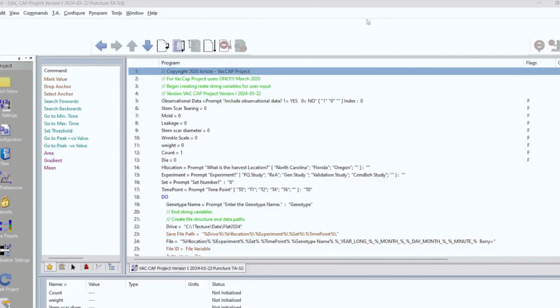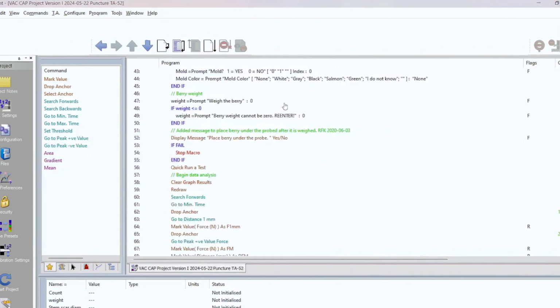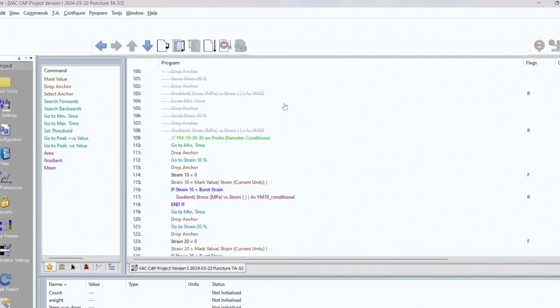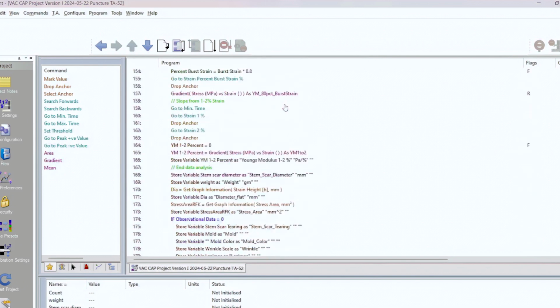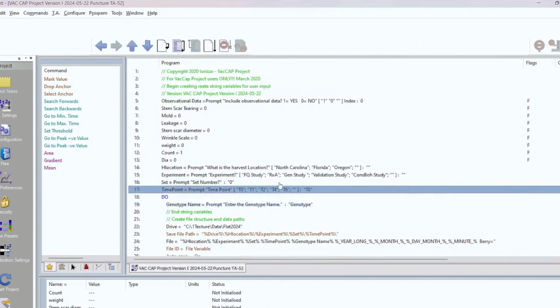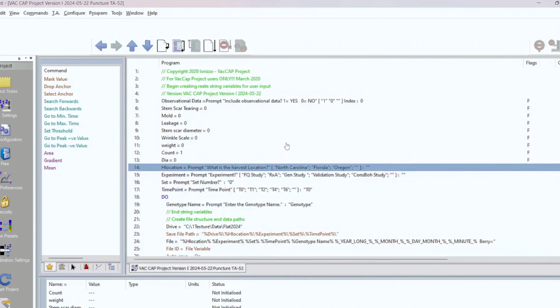After calibration, to measure the texture of a sample, you need to run something called a macro. A macro is a sequence of instructions for the texture analyzer, which is set up before your experiments. The macro includes instructions on what kind of information or data to collect from each sample. You can also integrate different devices like a barcode reader, a digital caliper, or a scale, and you can put in different prompts like what's the name of the sample or the rep, what's the date, and are there any signs of decay, or any other information you want to collect about a sample.